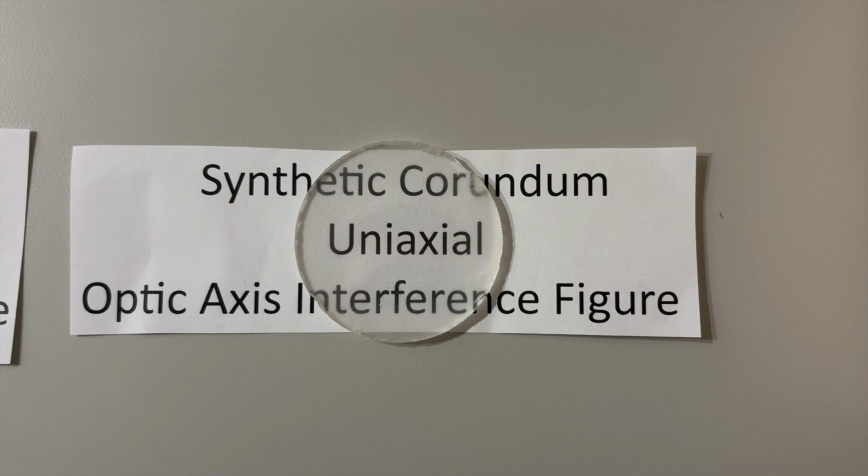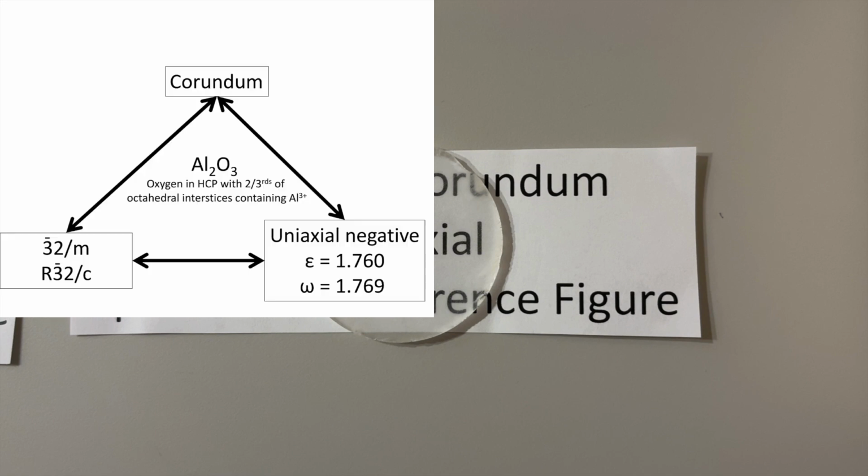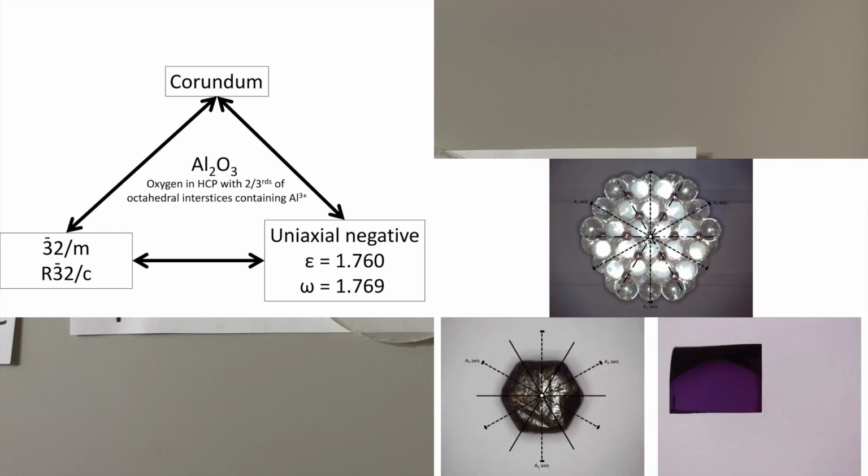There's an entire video detailing the nitty-gritty details of corundum if you want to check out Snellius Minerals LLC corundum kit. If you have checked out those videos, the following figures I'm adding on here are basically a summary of what's going on with our mineral corundum. But for the really big overview today of what we're doing, it's just sufficient to say our minerals are defined by their chemistry and structure. This in turn determines the symmetry of our minerals as well as their optical properties, and how these properties vary with direction through any single crystal of our mineral.